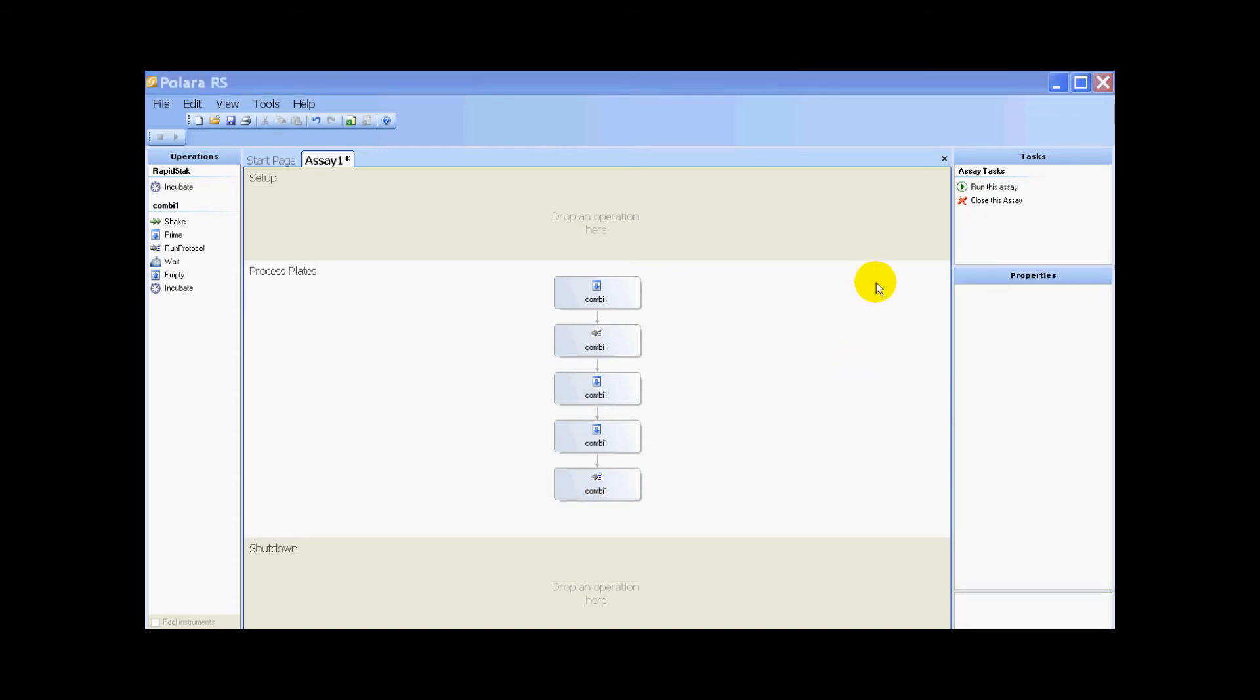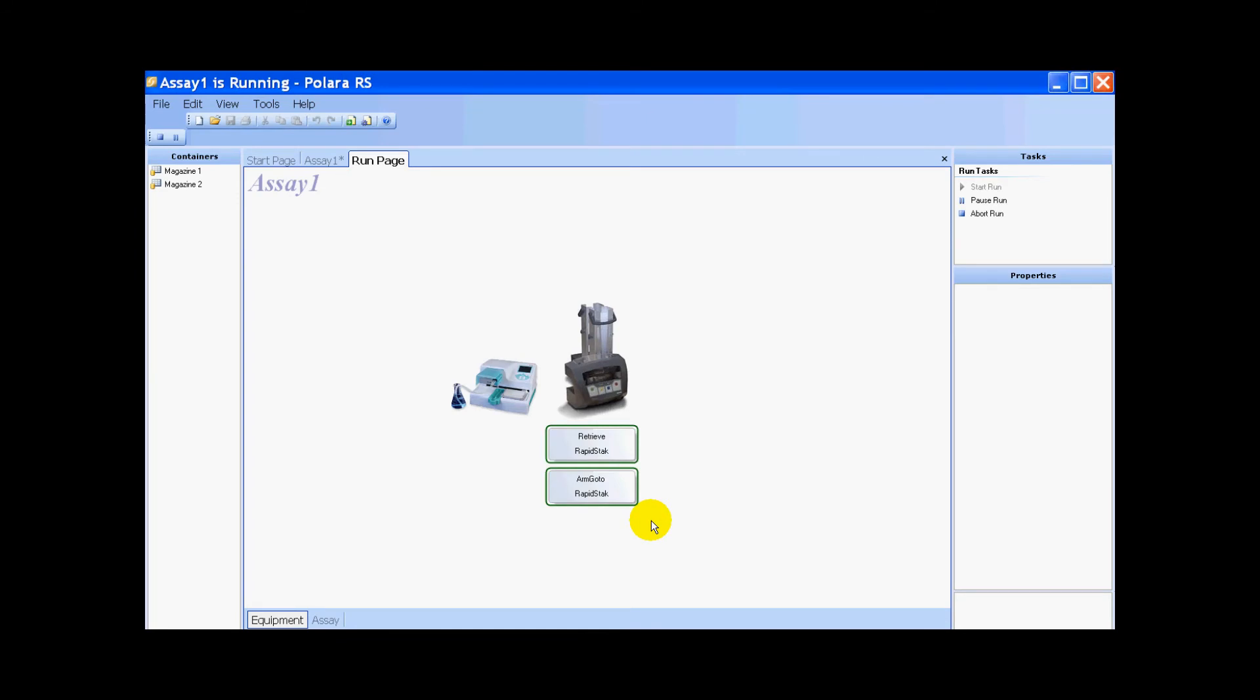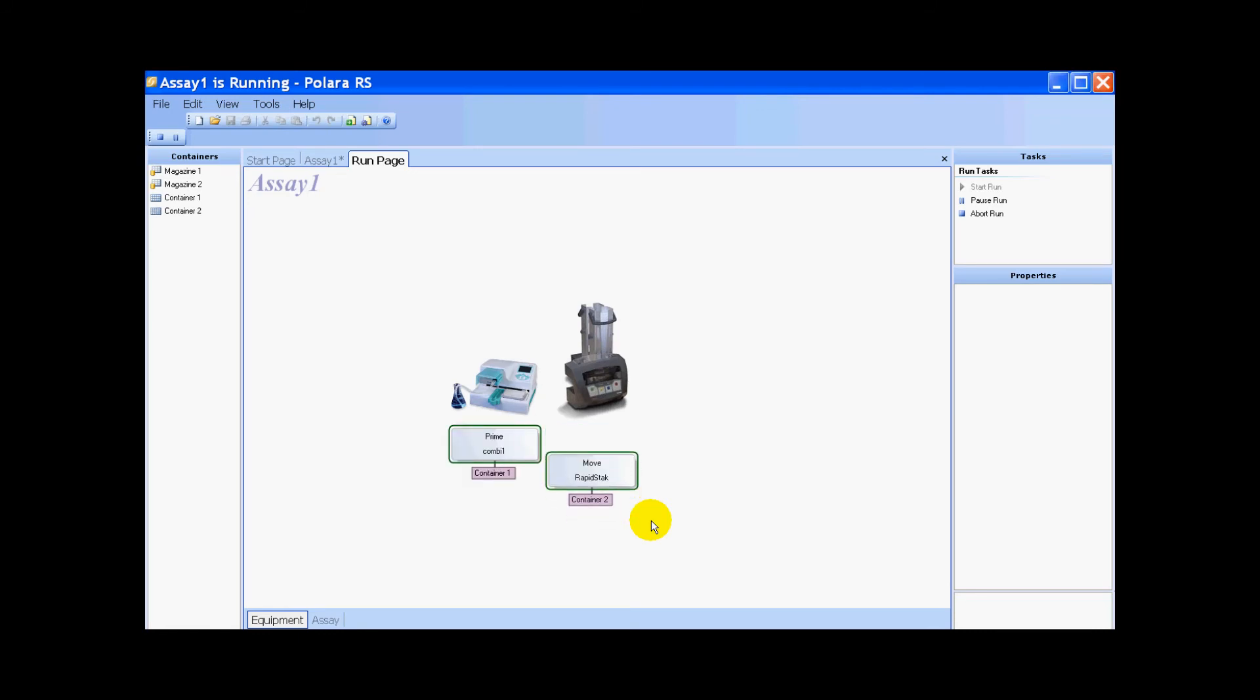Now all we need to do is select run this assay. On the start assay popup, you just hit start now. What you'll see is it looks like it's moving a plate from the rapid stack to the combi. But as you'll see in the previous screens where I show you what the action is live, I've physically put a plate onto the nest and there is no rapid stack setup, but it just looks like it.